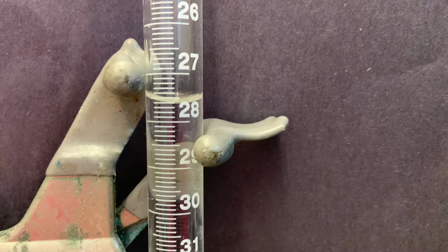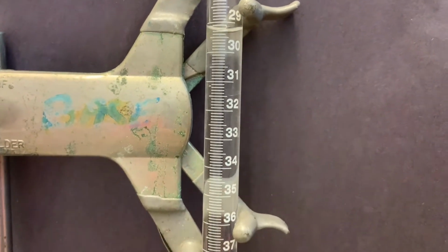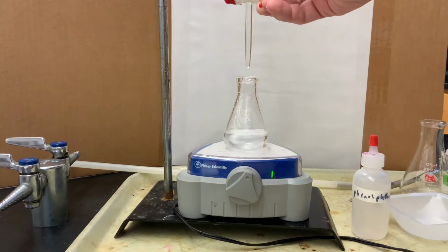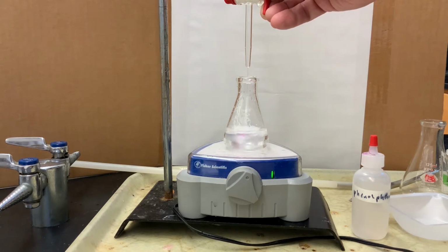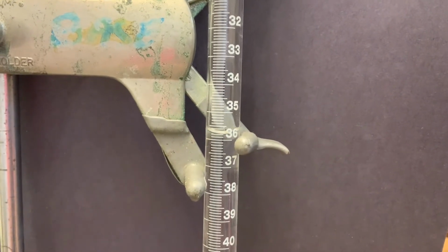Record your initial volume. And now we'll go in fast time as the base is entering the flask with the KHP. You recorded your volume. And now we'll show you the side view so you can actually see the indicator show up ever so briefly, indicated by the pink. As you know, that phenolphthalein in base will be pink. And then we'll go back to the view of the base entering so that you can be ready to record a final volume, also in fast time.